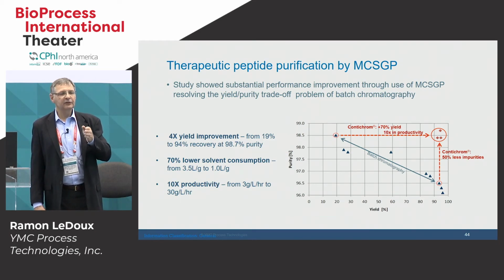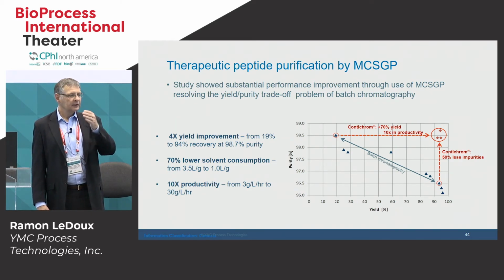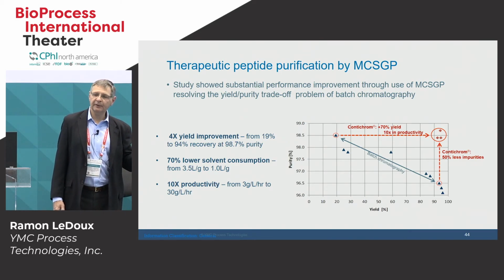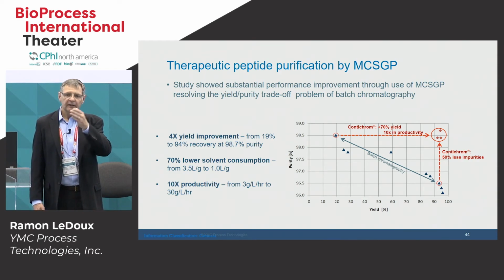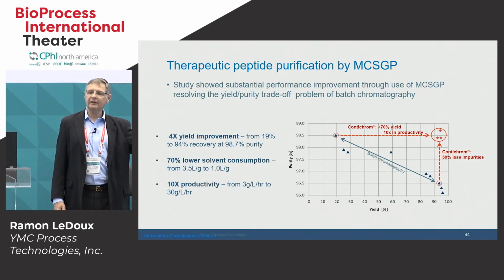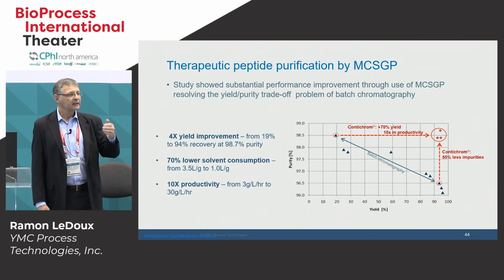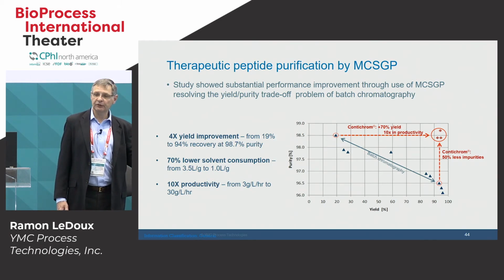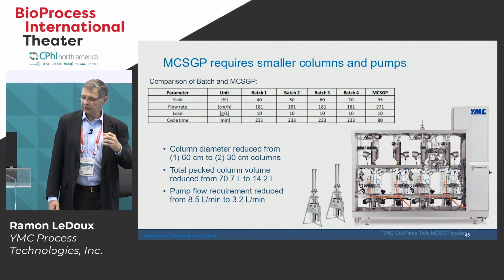What this also impacts, though, in peptide synthesis is that as your recoveries increase, the synthesis process can be scaled down as well. Because if your goal is to create 10 kilograms of end product and you're losing half of your product, you're at a 20 kilogram scale of manufacturing in order to counter the losses during the purification step. If your losses are greatly reduced, the scale of synthesis can be reduced as well and still meet your end goal.